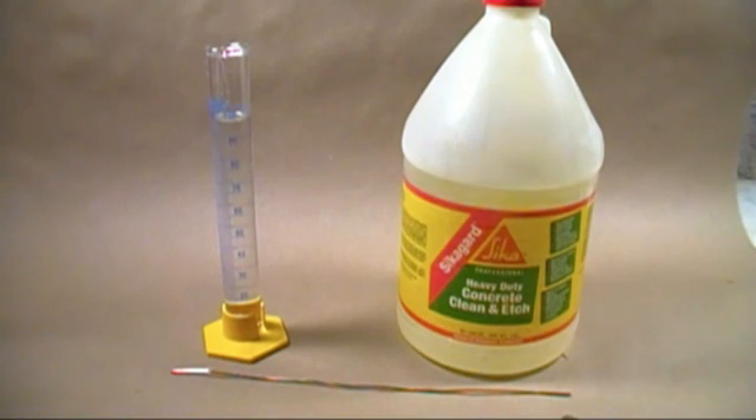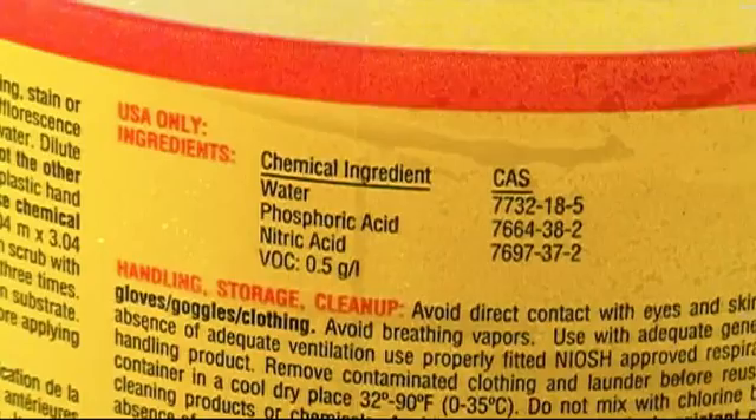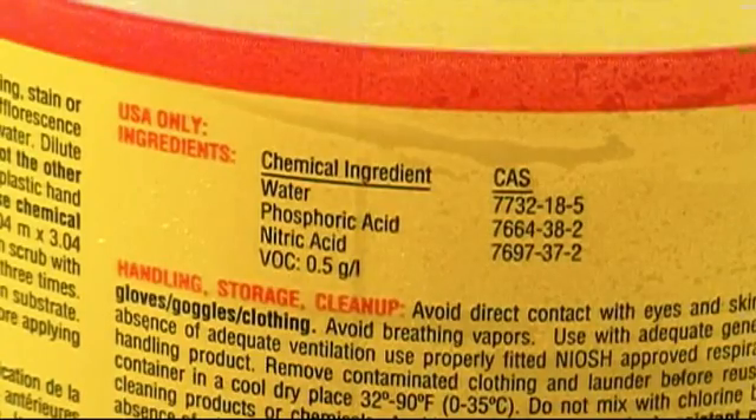Here's the product we're going to pull the nitric acid out of — it's called Sikagard Heavy Duty Clean & Etch for Concrete. I bought this at Home Depot about a year ago. You can also buy it at building supply stores, and the Sika site will list locations close to you. Viewing the back label of ingredients, you'll notice it's made up primarily of water, phosphoric acid, and nitric acid — perfect for distillation, since phosphoric acid has a high boiling point like sulfuric acid, and nitric acid has a much lower boiling point.